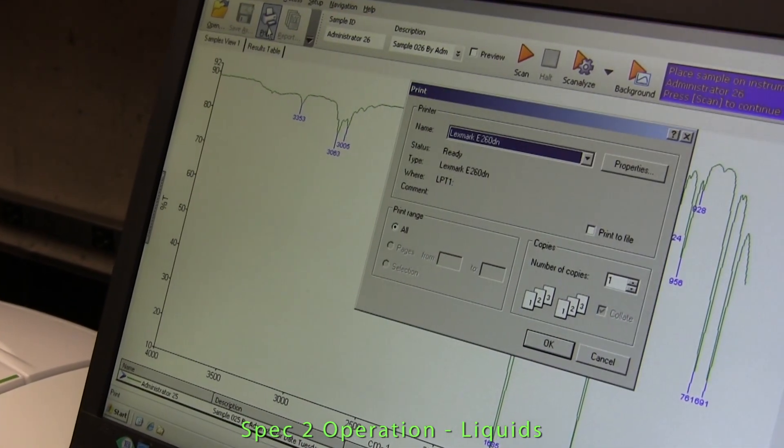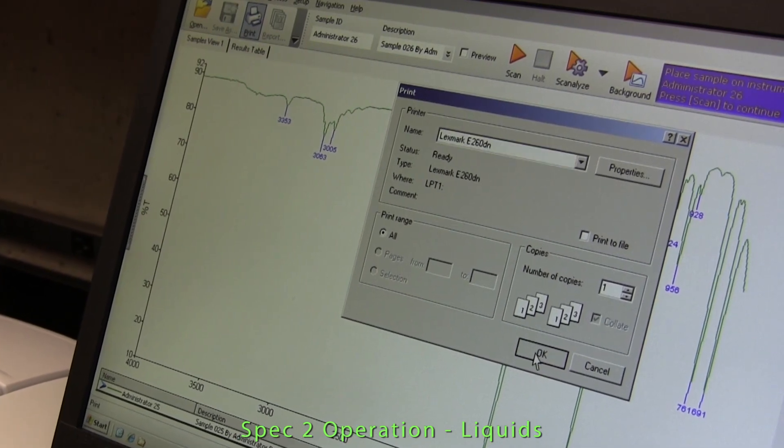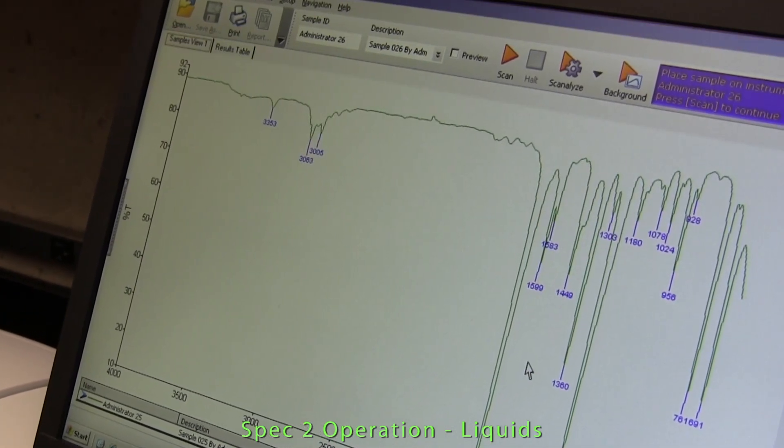Clicking on the labels icon causes the frequency position of the main spectral bands to be shown. And finally, by selecting the print icon, the spectrum is sent to the printer so that we can obtain a hard copy.